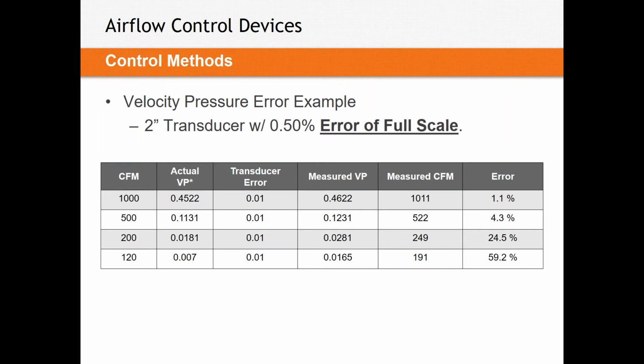That means our measured value might be 0.01 inches away from the actual value, giving us an error of, I'm sorry, I skipped a line there. Might be measuring 0.12, which gives us an error just under 5%.